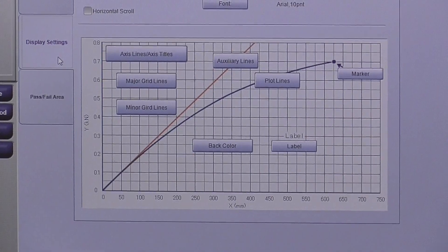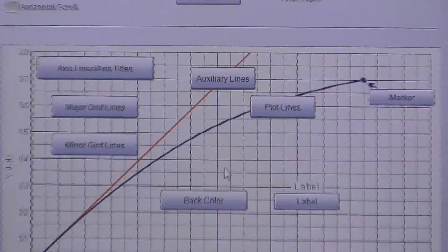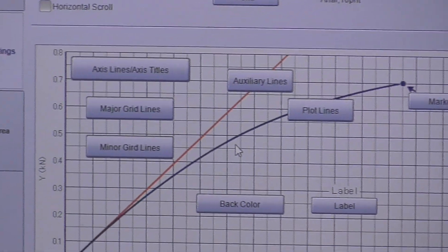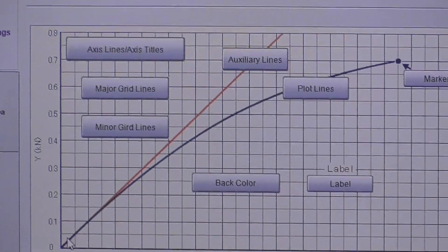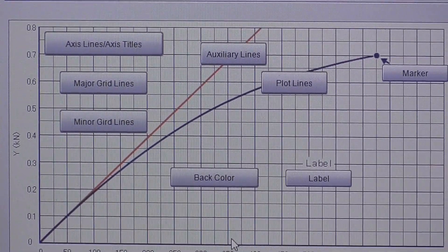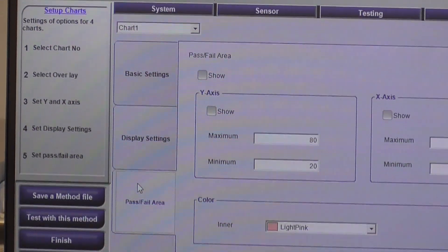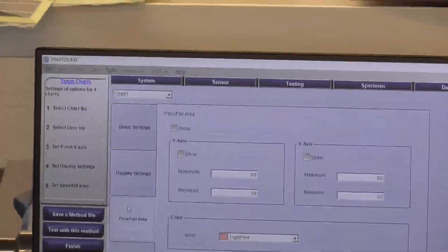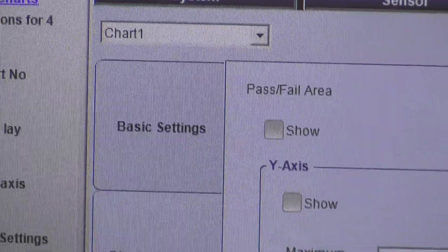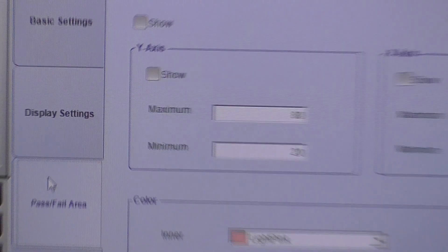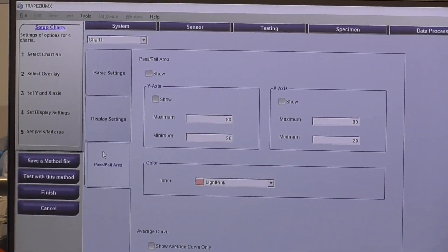Going down to the setting tab, this is kind of more mundane, changing the color of your plot lines, the spaces of the markations between the x and y axis. Lastly, you can set up a pass-fail area. This is more common in QC where essentially it creates a color on your graph, so it's a quick check whether your sample has passed or failed a predefined criteria.